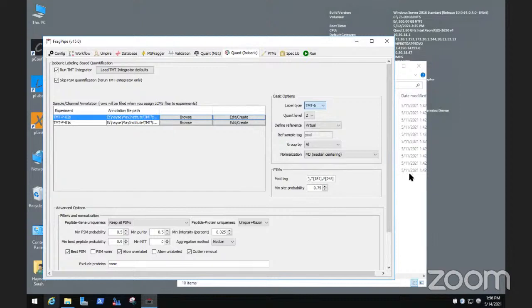We created it for historical reasons because we wanted to provide a workflow that will replicate pretty much the CPTAC analysis where there was a bridge approach used. So we wanted to not just have a default workflow, say with virtual setup, but also the one that's for exactly what was done for some of the analysis. So we basically duplicated the workflows, but that's the only difference I can think of.